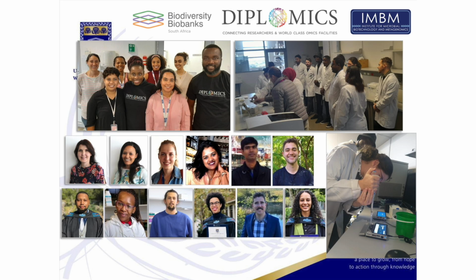This is just a portion of the folks who we've trained on ONT sequencing over the last 2-3 years. And again, it's all with the help of Diplomics. So we use it as a vehicle to get people familiar with NGS. At the same time, they're sequencing these genomes and it becomes a resource for everybody. So it's been a fantastic effort.